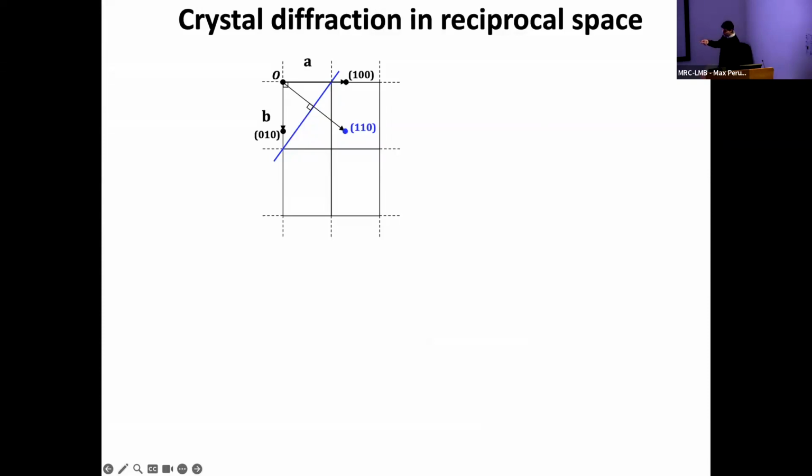It's going to be reciprocal space. This means the longer the distance from the origin to the plane, the shorter this vector is going to be. So these are the other families, 2-110, 120, 220. The length of this vector is 1 over d, reciprocal space.